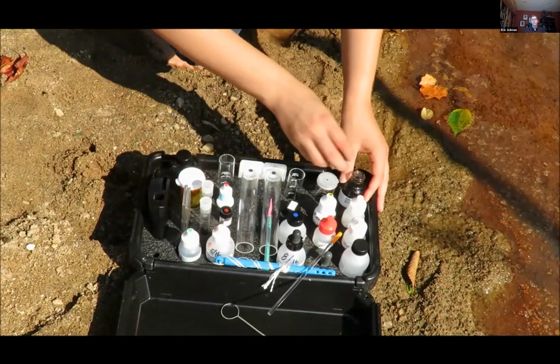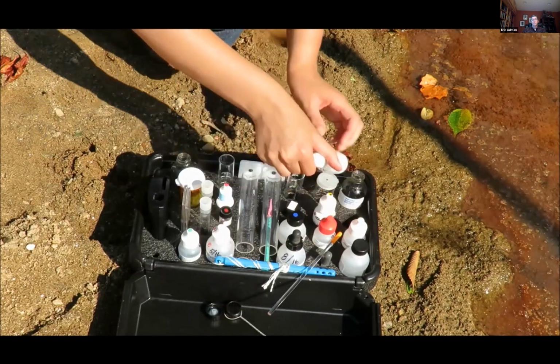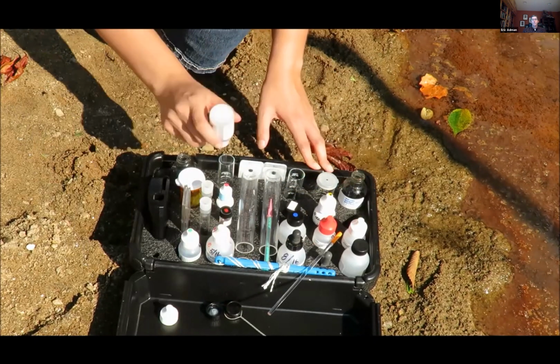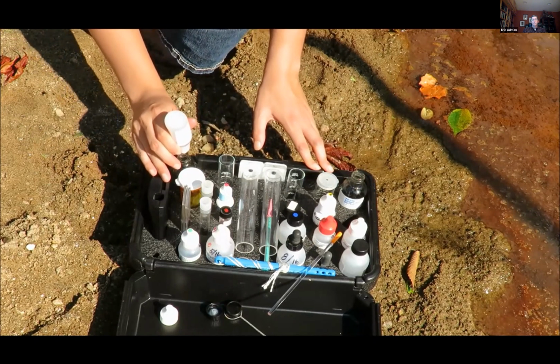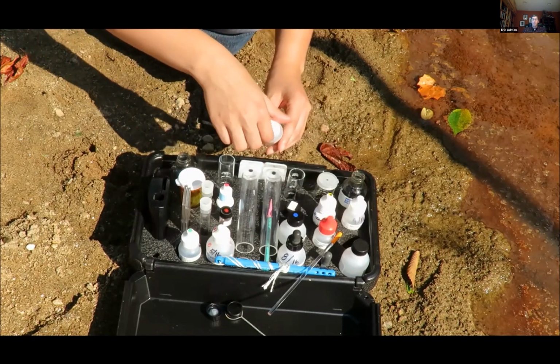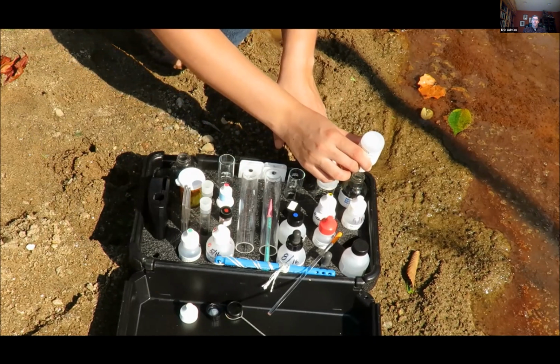Locate the manganese sulfate bottle. Uncap your samples and add 8 drops of reagent to each. Locate the alkaline potassium iodide azide bottle and add 8 drops to each sample.